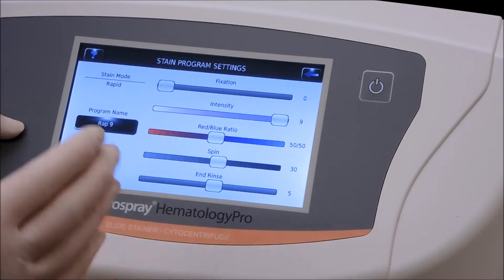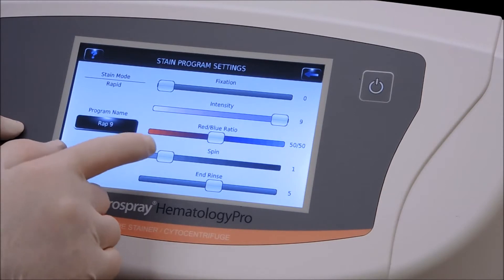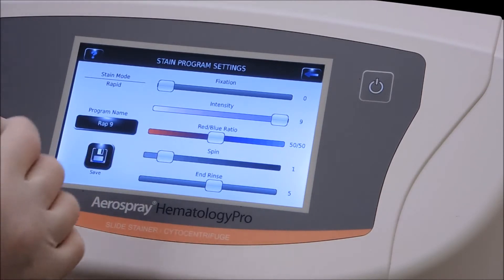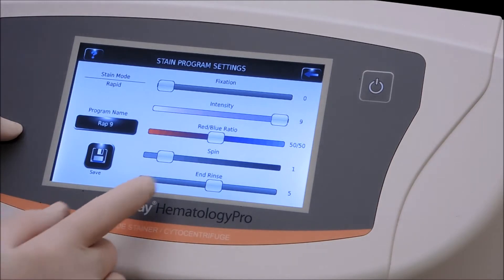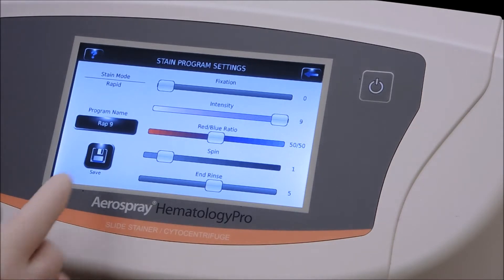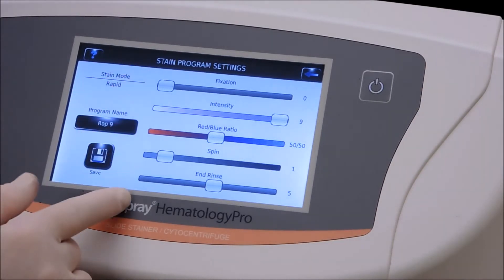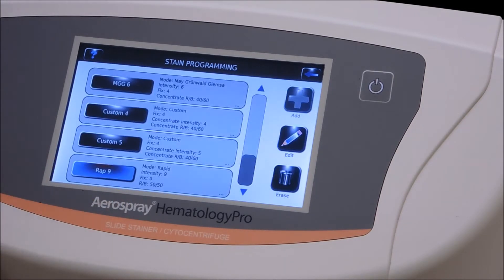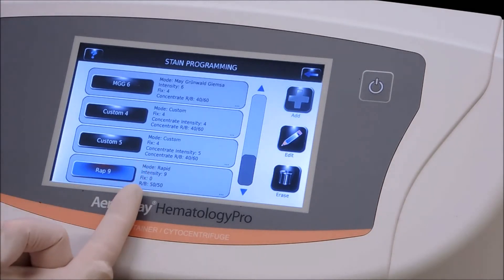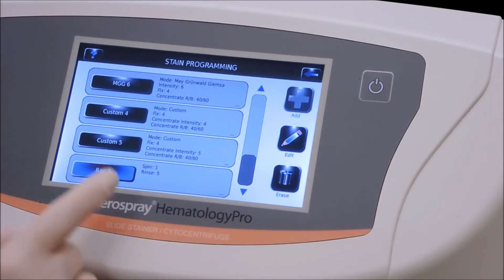The red/blue ratio we want to stay at 50/50, so you have half red and half blue. Continuing through, the spin can be decreased — you can tap the bar or touch the cursor and move it across. We're going to leave the rinse on because we want to be able to clean up the carousel.